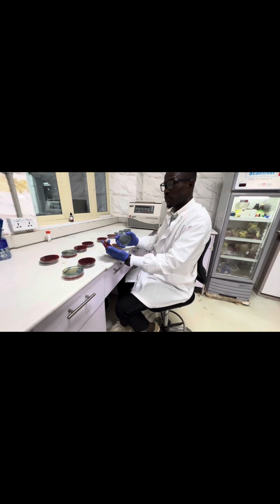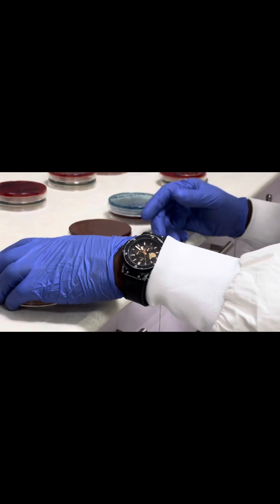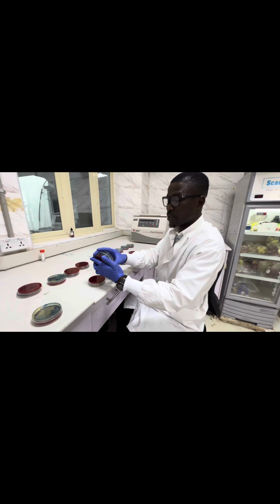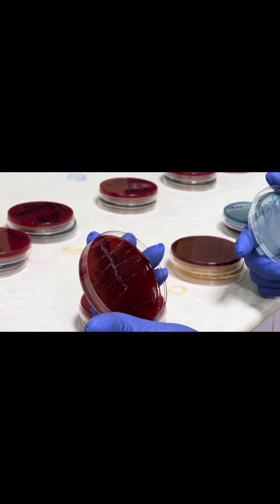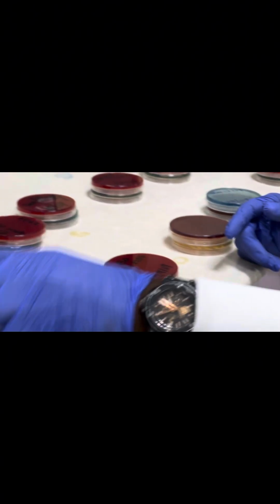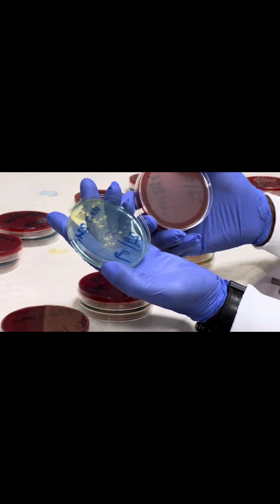If you count, this will be like 1, 2, 3, 4. It's definitely far below 1,000. And this is another case too. This is on the CLED. Its colonies are far below 1,000 colonies, so this is also insignificant. Then this is also insignificant. This is also insignificant.